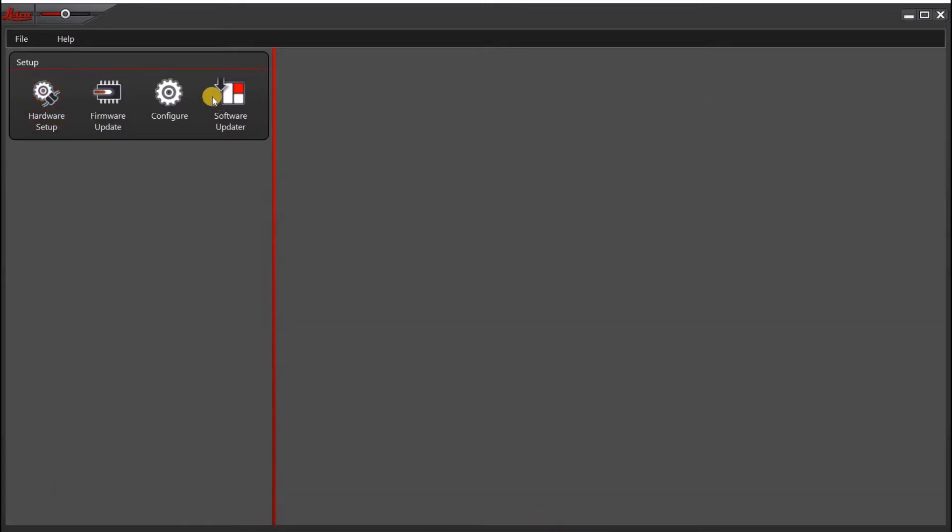Click OK. The next thing you want to do is make sure that you have a simulator as a camera.